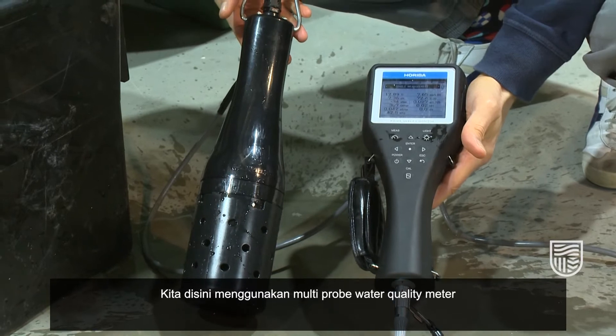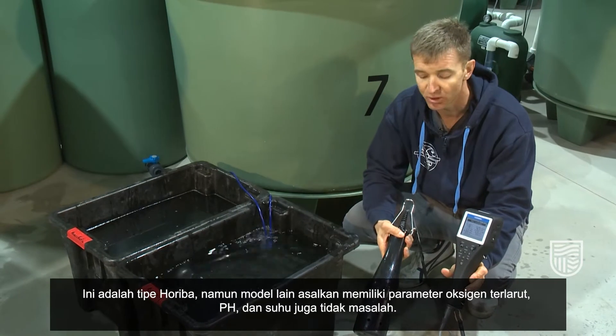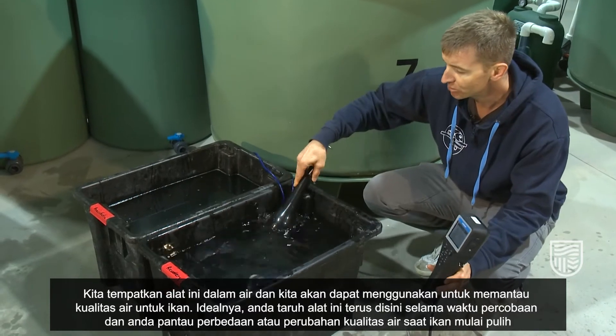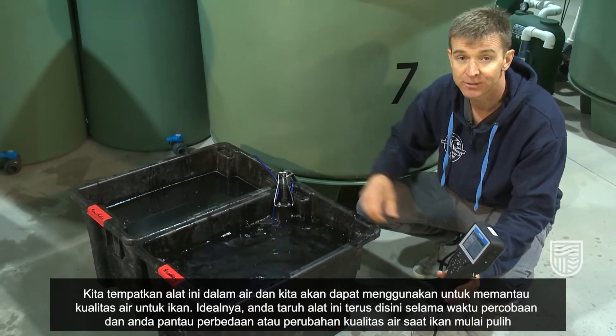We actually use a multi-probe water quality meter here. This is a Horiba model, but any probe which has a dissolved oxygen, pH, and temperature sensor is fine. We place these into the water and we can use them to monitor the water quality for the fish.